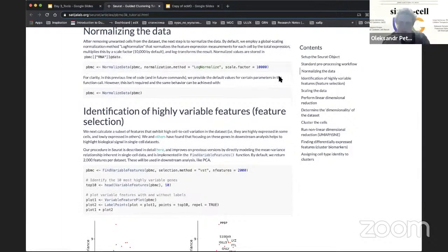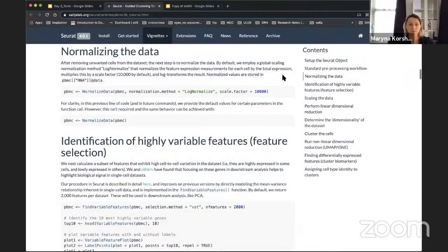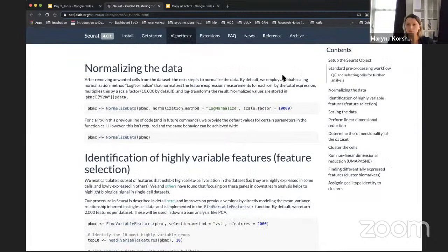Which normalization would you say you use the most? Is it log normalized or SCTransform? I use SCTransform, because SCTransform is both normalization and scaling, as I remember. That is why it's more advanced. Anyway, when it was Seurat version 3, I did normalization and scaling in two commands consecutively, and literally did not change it so much. So actually, the merging of these functions was expected.